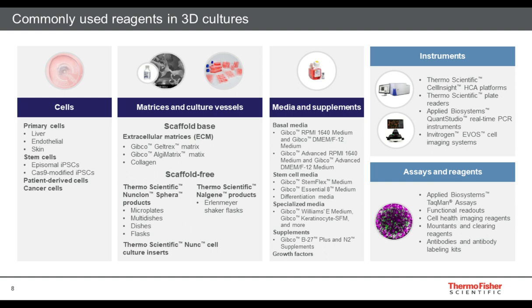The other things that can be used for analyzing these systems are things like high content analysis platforms, as shown here on the top right. But you can also do more standard approaches, where cells can be taken and RNA isolated for doing qPCR analysis of gene expression signatures, or of course cells can be isolated and other sequencing technologies can be applied to better characterize the cell population, and also using more standard upright fluorescent microscopes that are more benchtop-like instruments, such as the EVOS cell imaging systems.